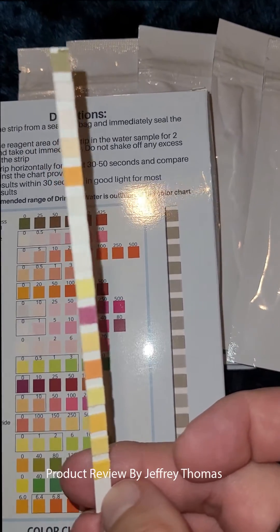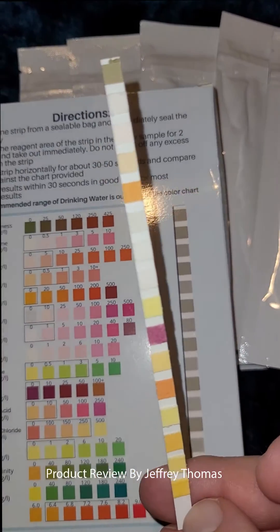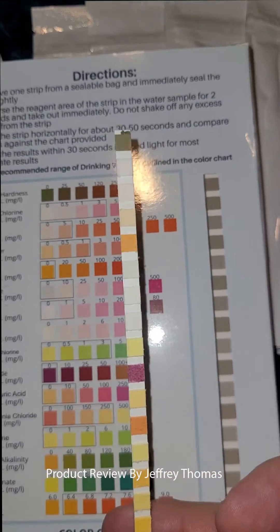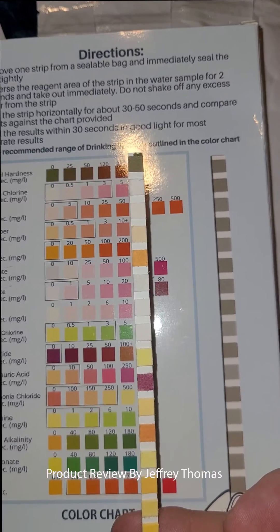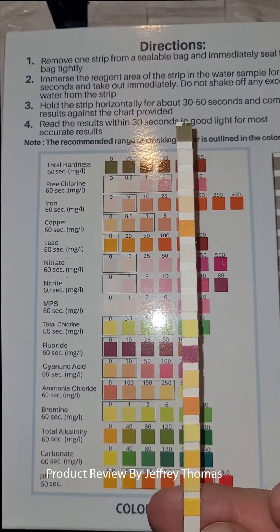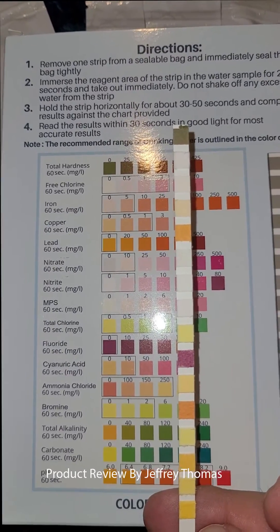It also tests total alkalinity, carbonate, and pH levels. It's really easy to use — you simply dip the strip in the water, hold it without shaking it off, let the color pads develop, then hold it against the chart on the box. That tells you what different things you have to deal with if there are any problems with the water you're testing.